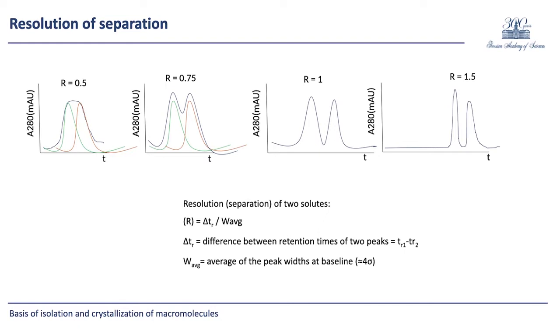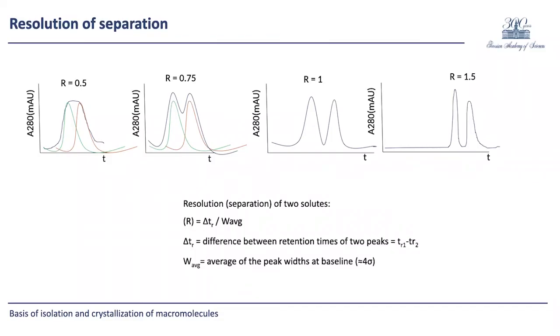On this slide, you can also see such peaks, but it happens that substances are not well-resolved, and you get one wide peak. Such a situation is shown on the upper left graph. This peak contains two substances and two peaks, but they are situated so close to each other that such a system cannot separate them. In all fractions, you will have two substances, but in different proportions. In the first fractions, you will have more substance 1 and less substance 2. And in the last fractions, you will have more substance 2 and less substance 1.